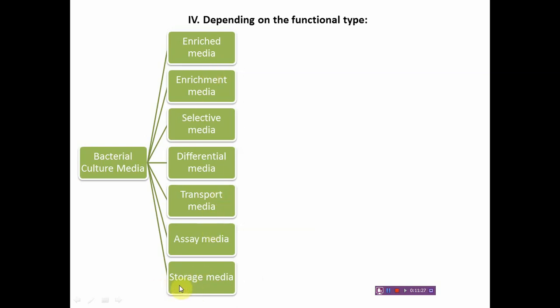Storage media is used for long-term storage. Assay media is used to carry out a variety of microbiological assays. Transport media is used for transportation of delicate or sensitive microbial cells. Differential media and selective media are used for specific microorganisms for differentiation purpose.